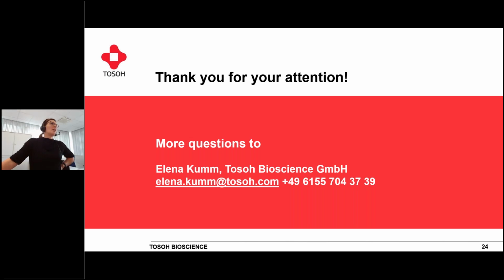I think often when you're alone with your method, you're a bit lost and you don't know what to do in the beginning. Totally normal. And then you don't dare to ask people from companies. But if nobody else in your research group can help you, sometimes the easiest thing is to just ask the people selling these columns and say, hey, what would you recommend? You don't have to tell us all the details. Just say, I have something with an isoelectric point of maybe this and this, what would you recommend to do? I hope this answered it a bit.